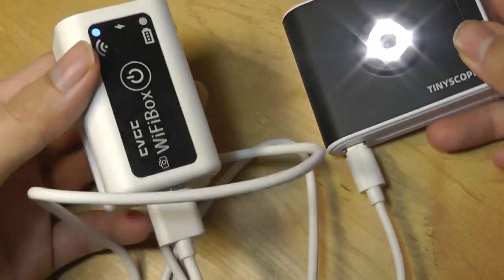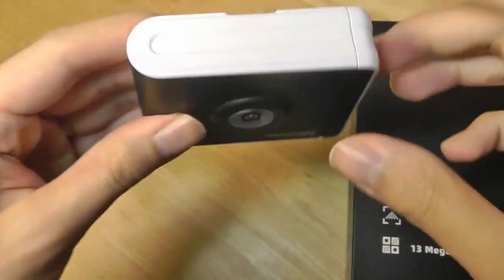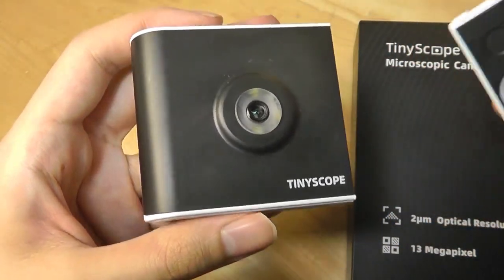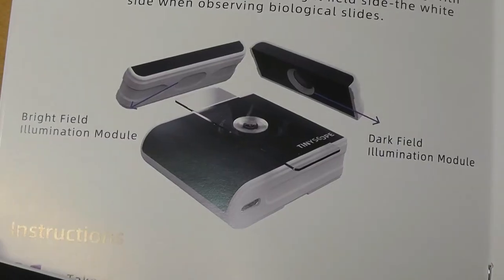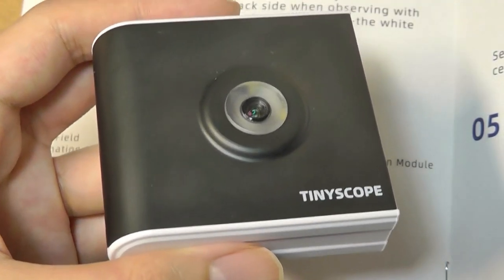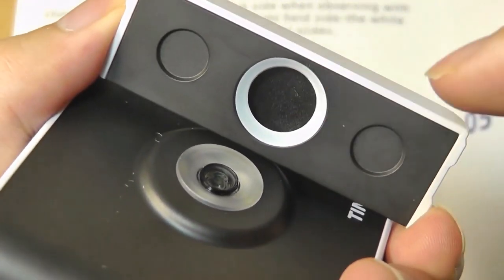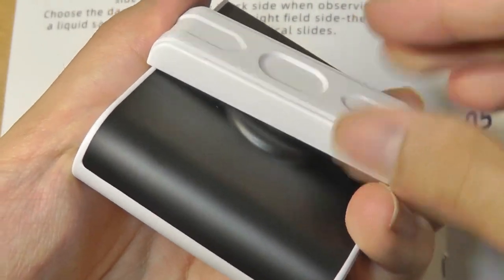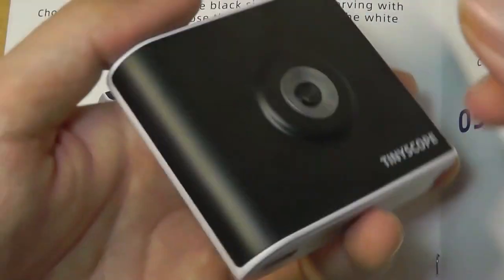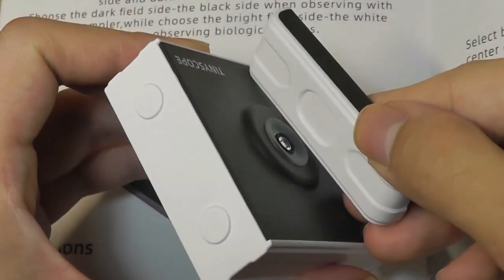As we take a closer look at the TinyScope, it's constructed out of polycarbonate plastic but feels actually pretty solid. On the side is a magnetic latch that you can pull out, which provides some extra modes depending on the subject you're looking at. For instance, when looking at a liquid, you may want a dark background to emphasize the liquid's color — you can put this against the side and because the background is black, it will prevent reflections from going onto your subject. Alternatively, if you want a bright background when exploring the sample, you can use the white background to shine against the object.